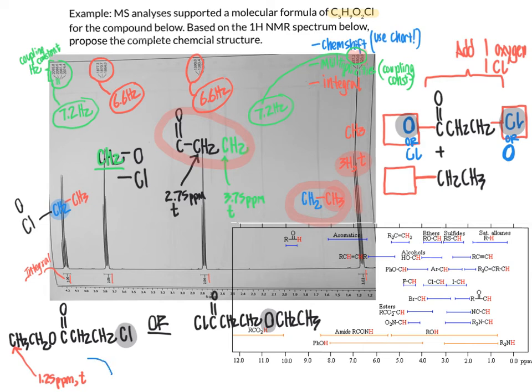We come to the next position, that's our CH2 group right here. And we said that due to the fact that the methyl group here was coupled to a CH2 group, and that CH2 group that it was coupled to was the one over here, the quartet, which was our furthest downfield signal, that represented a signal at 4.2 ppm. And that was a quartet. And so far, this is all adding up. This is all making sense. That would be at 4.2 ppm and a quartet, based on the fact that it's the 3 vicinal hydrogens from the methyl. And it's at 4.2 ppm, very downfield, particularly downfield, because it is adjacent not only to an oxygen atom, but then it's one further bond away from this carbonyl group that's also going to act to withdraw electrons from it. And so downfield it is.